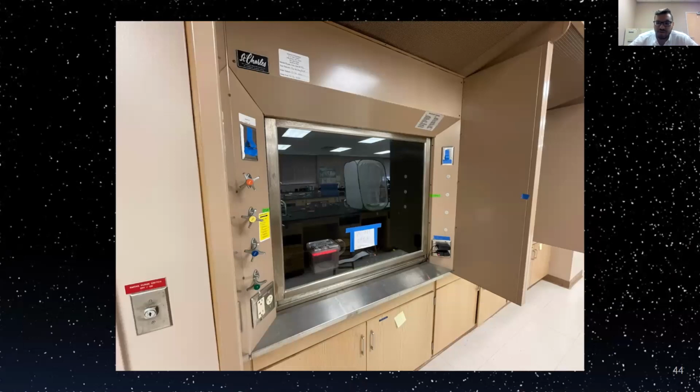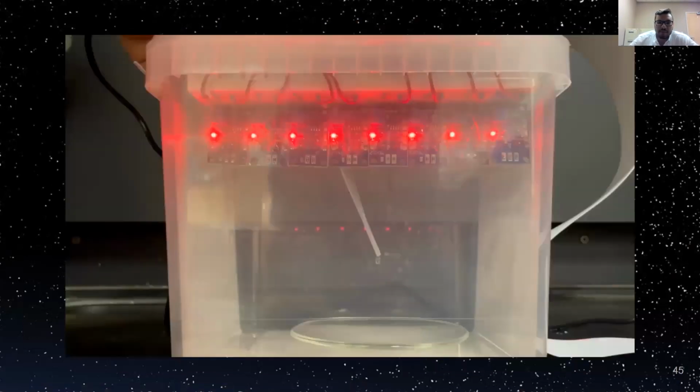At the time of all these experiments, there's no students having class. We do have some of the solar work going on, which we'll discuss later, in this room, but it shouldn't affect these experiments at all. This right here is an image of me depositing acetone inside the watch glass, and you can see this red light here indicates that our sensors are on and powered on.